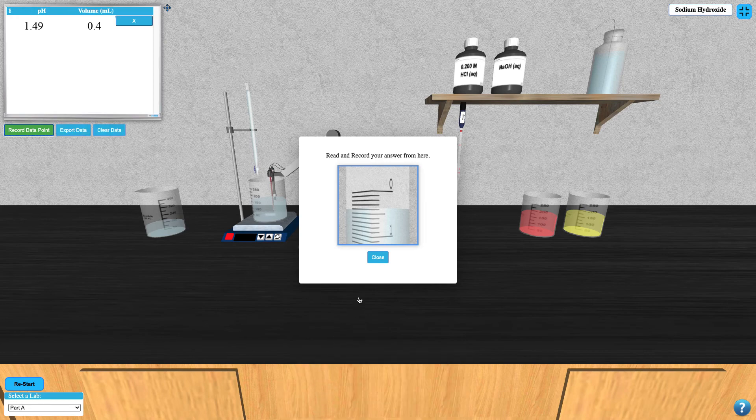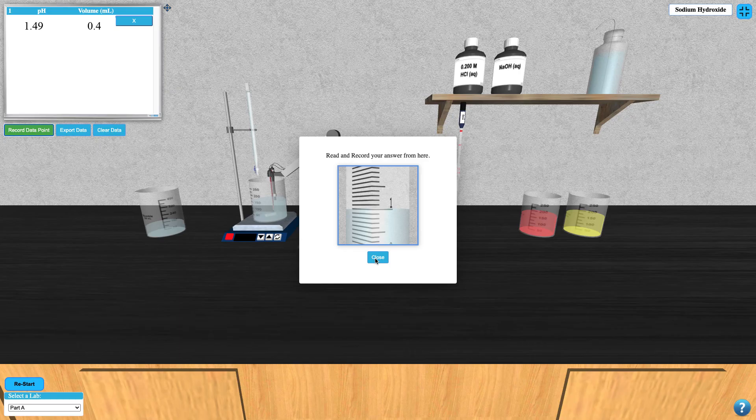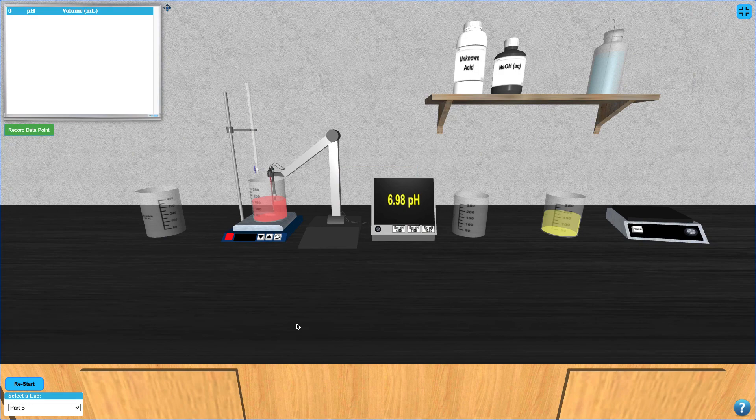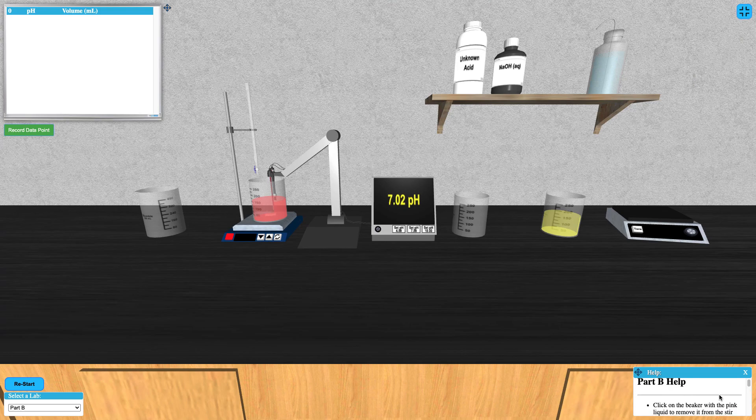Once you've recorded enough data points, you can export your data to Excel or any other spreadsheet program. Subsequent parts of this simulation operate in a nearly identical manner. If you need extra help, consult the help button at the bottom right of your screen.